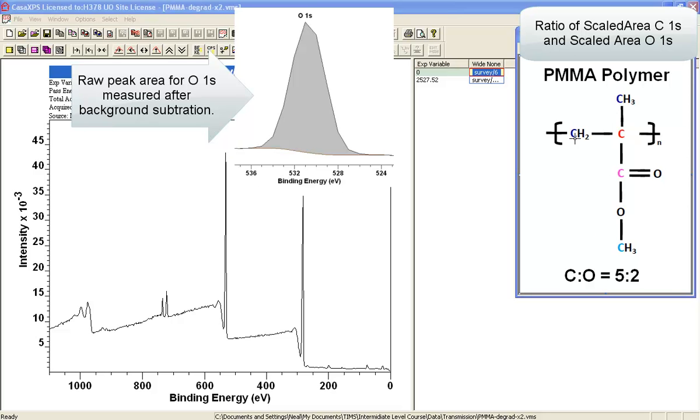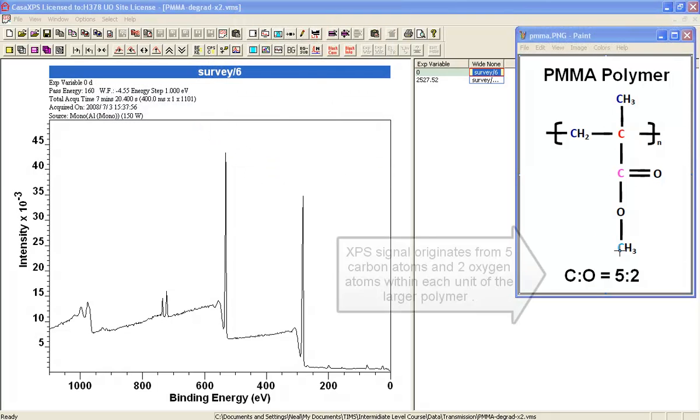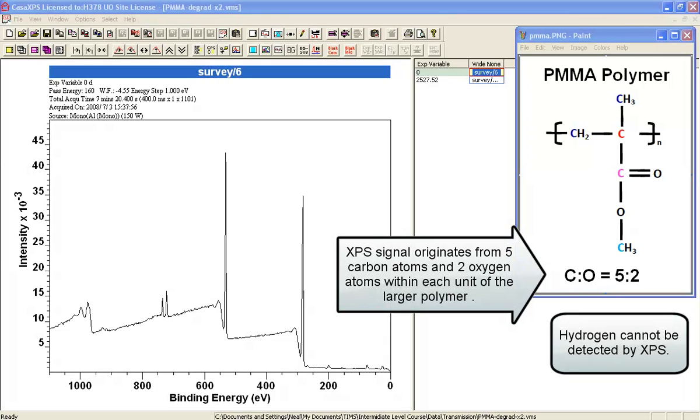Counting the carbon, you can see we have five carbon atoms and there are two oxygen. Therefore, we should expect a ratio of five to two.